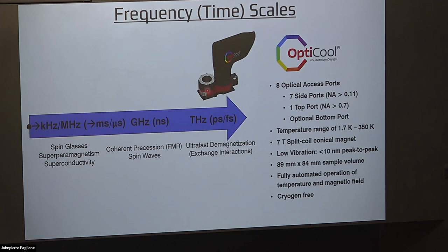But it's tough. And that's one of the specs that we guarantee at the factory, the vibration spec, because for most people, especially anybody wanting to do a microscopy experiment, vibrations are killers. But we can't go back to liquid helium anymore. As we all know here, there's no going back, I don't think.